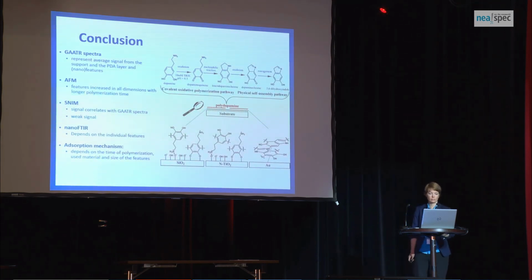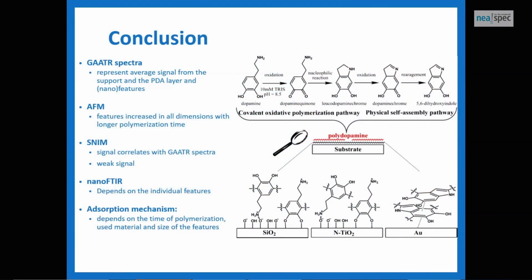Using macroscopic and nanoscopic techniques, we suppose that the PDA molecules are adsorbed via oxygen in the case of silicon and titanium surfaces, and via aromatic systems in the case of gold surface.